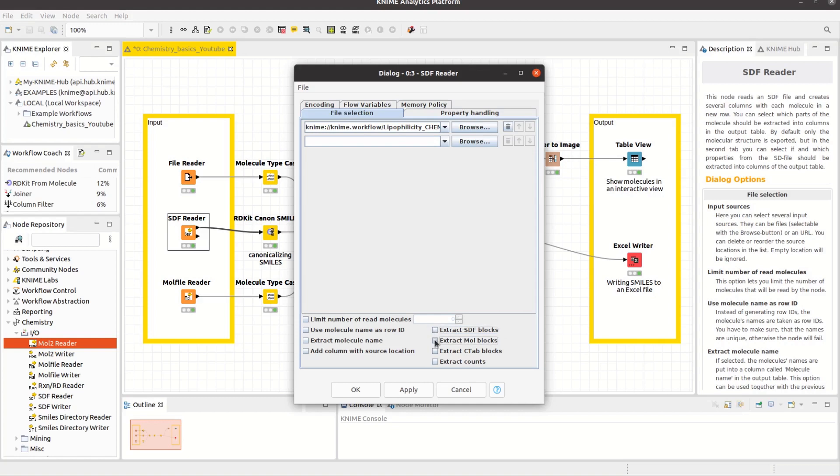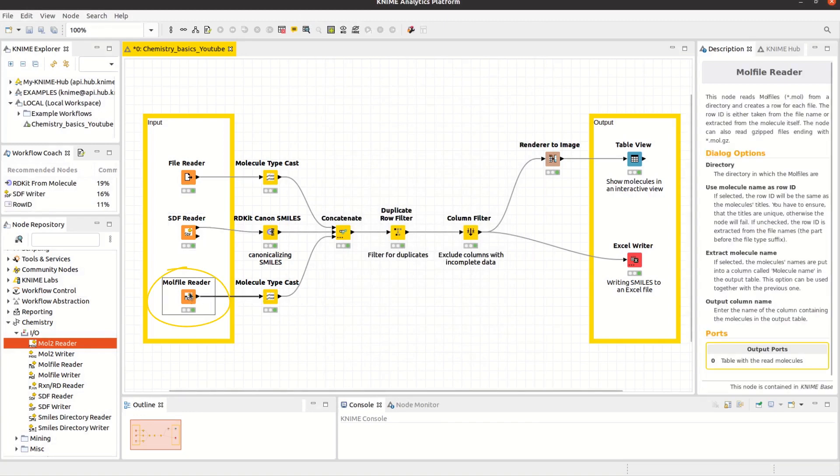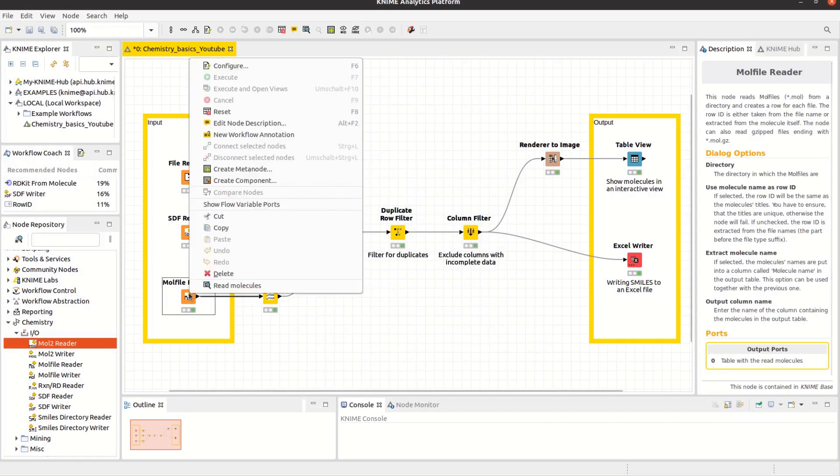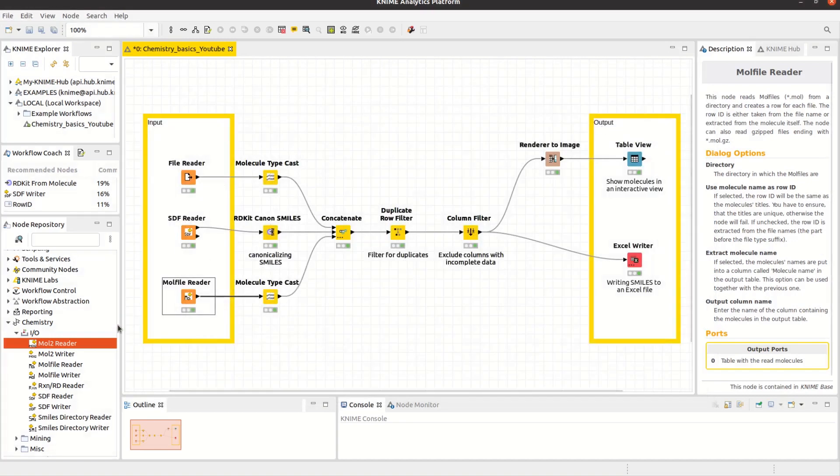Furthermore, if you are interested in the molecule's Atom and Bond counts, you can also select Extract Counts. Last but not least, I want to show you the mole file reader, which reads in mole files from a directory and creates a row for each file. The KNIME Base Chemistry extension also provides a MOL2 reader.